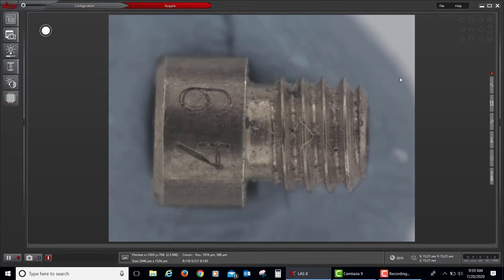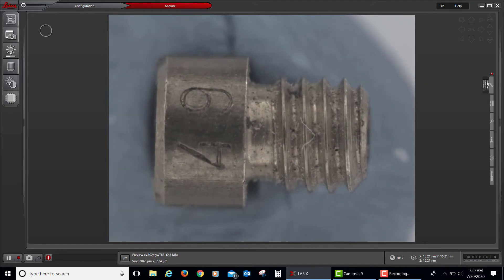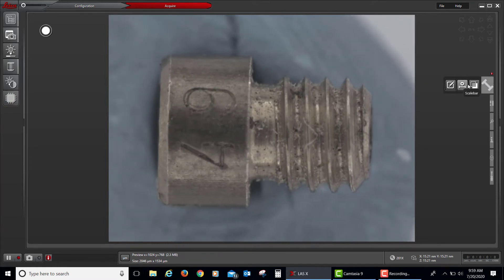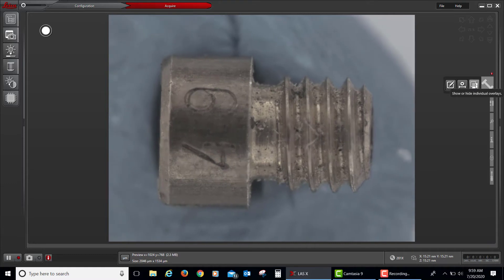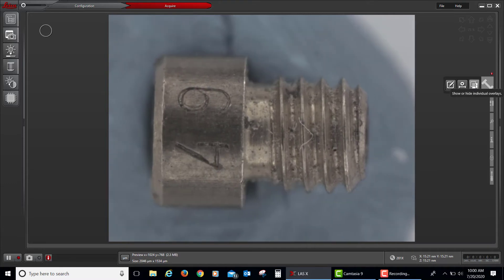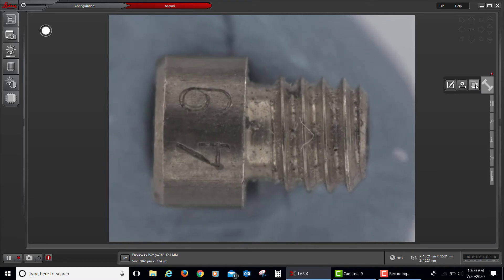On the right-hand side, we see we have adjustments for adding a scale bar as well as showing or hiding that scale bar when we burn it into the image.